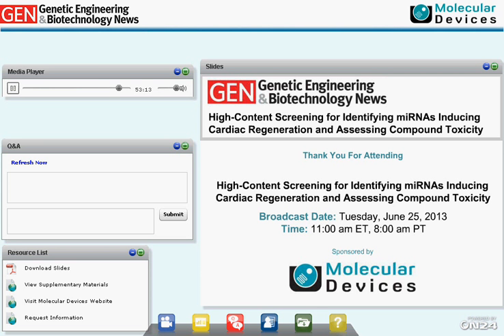All right, Evan, here's another one. How long do you have to incubate the cardiomyocytes to see beating? Well, that's actually the important one. When you plate the cardiomyocytes, at least the ones we're using from Cellular Dynamics, you'll see contractions in about 3 to 4 days, and then we typically wait 7 to 10 days to get very good regular contraction rates over the whole well. Some other researchers have been waiting 14 days and sometimes longer, and you do see an increase in the contraction rate if you let them mature longer. So there are some benefits to doing that, but again, we typically wait 7 to 10 days post-plating.